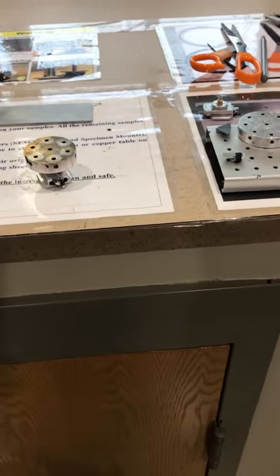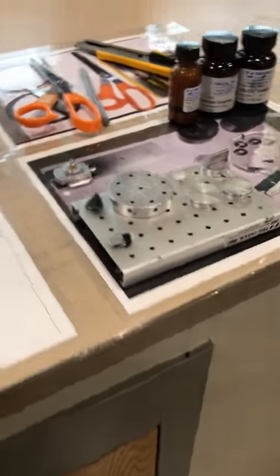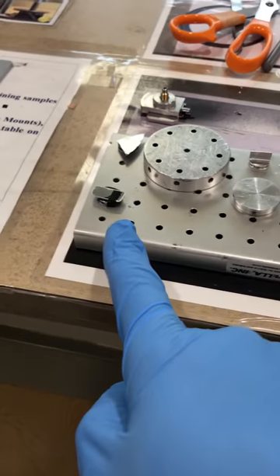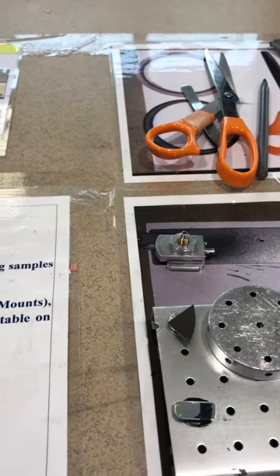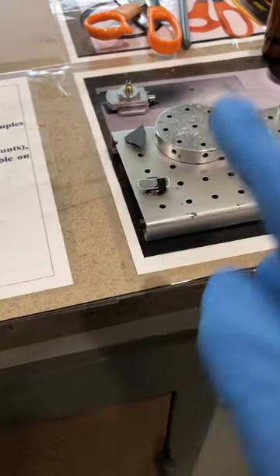In this video I'm going to show you how to load your sample inside the microscope. We have different kinds of SEM stubs and sample holders — you need to pick the one based on your analysis, then mount your sample on it using copper or carbon tape, which are very conductive tapes used to mount your sample on the SEM stub.